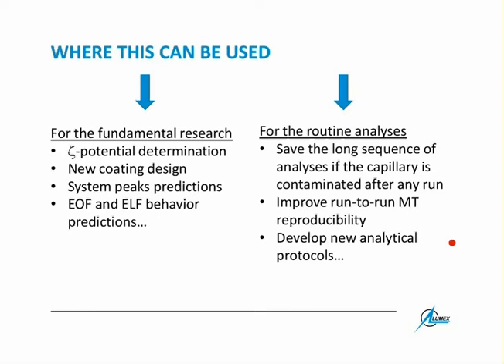That's clear. Yes, but it also can be used for many fundamental research topics like zeta potential determination, new coating designs, and so on and so on. Yeah, this is if we are talking shortly about reproducibility and how we can get excellent results with reproducibility. Okay. Let me now cover some other questions which popped out for our webinar talk.